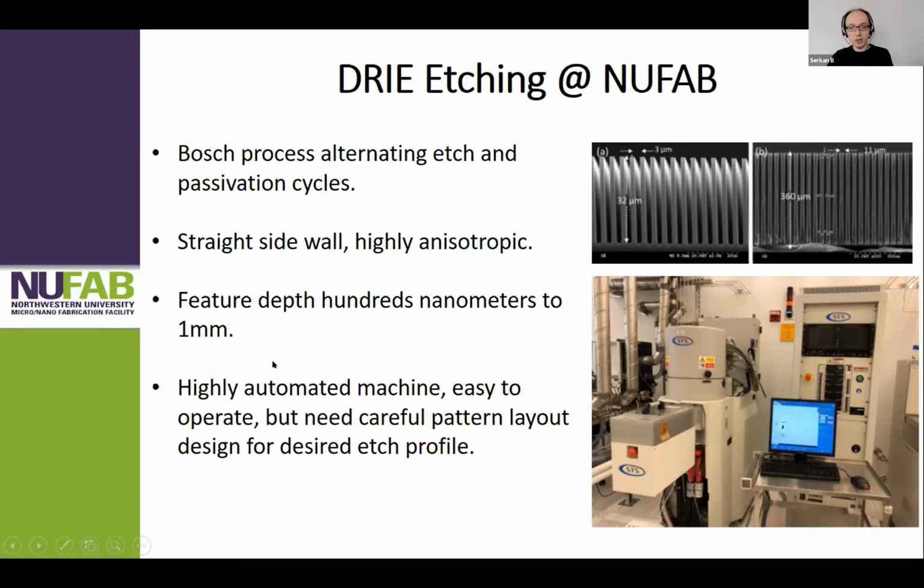We can do nanometric size features too, if you are interested in nanofluidic type of stuff. But you can do devices on the order of millimeters or centimeters as well. It's a highly automated machine. It has a load lock. We put the substrate in, and we just send it in, and it will finish the recipe for us, and then we'll take it out.